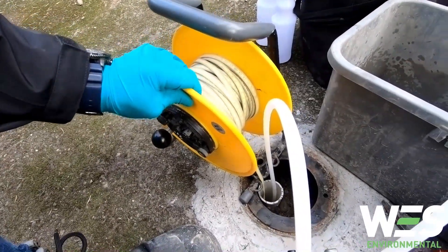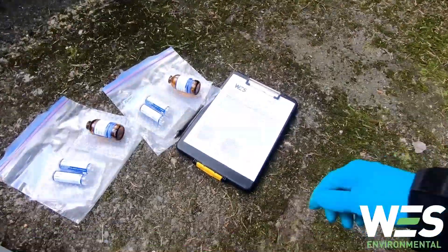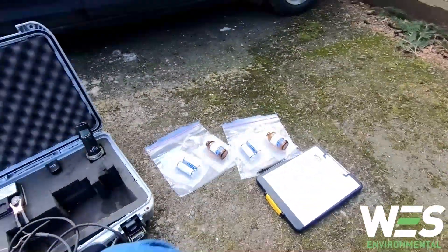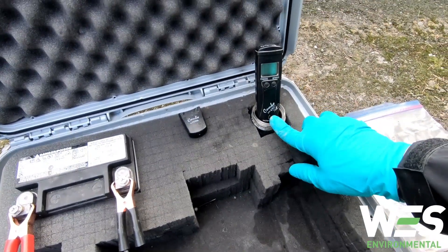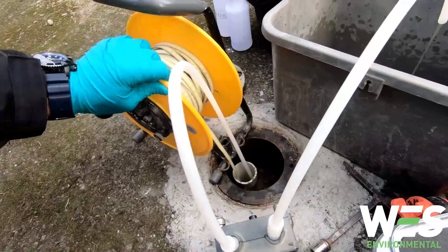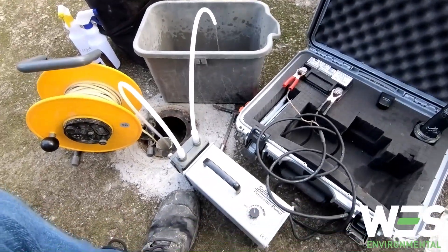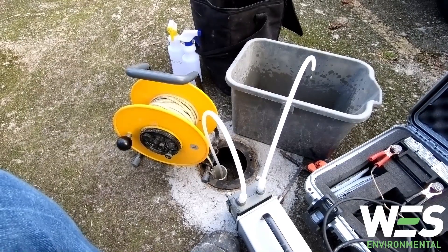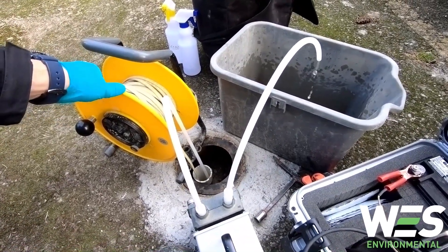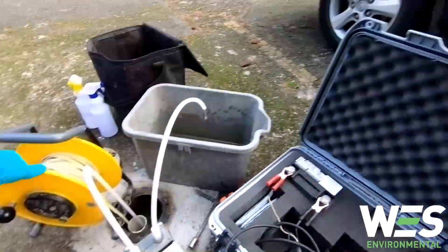You've got your water meter left in the well so you can take periodic measurements of it. I usually measure every three minutes or so on my field sheet. You can also go by volume, maybe every half liter. So when that three minutes is up I fill up this jar and I take a reading of the parameters and then I also take a reading of the water level. And I'm gonna do that every three minutes until I get three consecutive readings that aren't varying too much — that would tell me I'm getting a representative sample of the groundwater and that's not just the water that's kind of been sitting in the well.